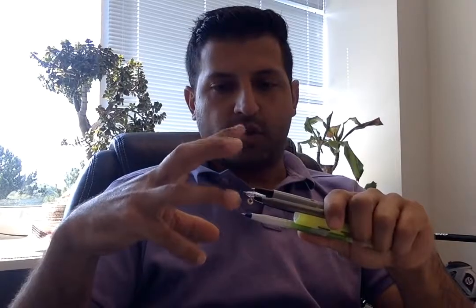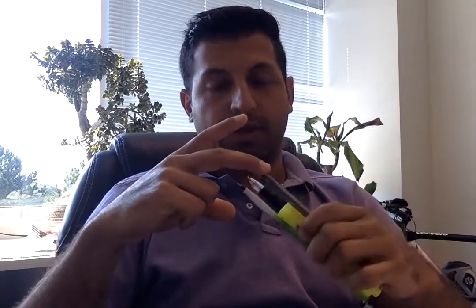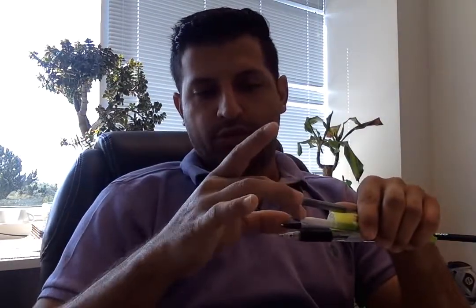And what happens is that if you have these 4 electrodes and you have multiple neurons, when this neuron fires, this is closer to this electrode, so you'll get a larger waveform on this electrode than this one. So larger waveform on this electrode, medium waveform on these, and lower on this one, versus when this other neuron fires, then you get a large waveform on this electrode, medium waveform on this one, and small on that one. So all of them record the same waveform at the same time.